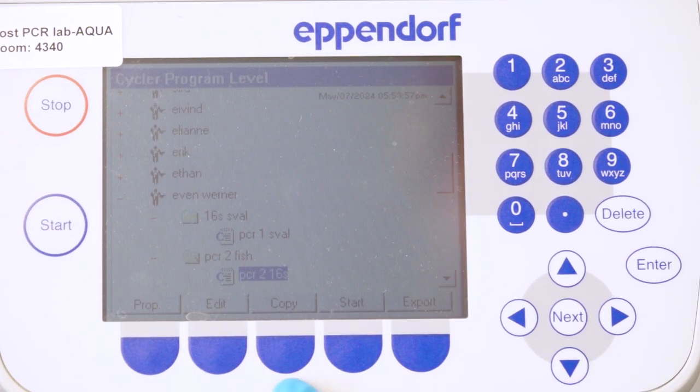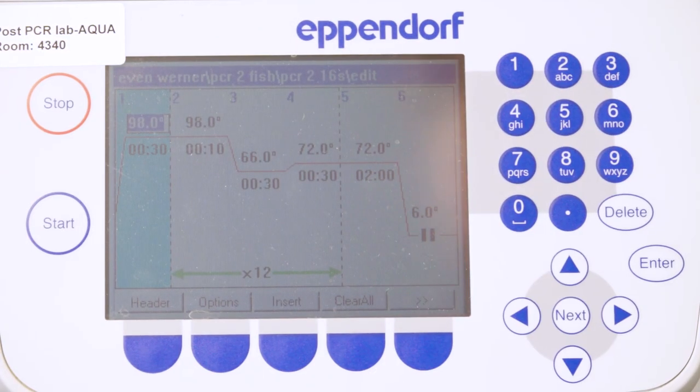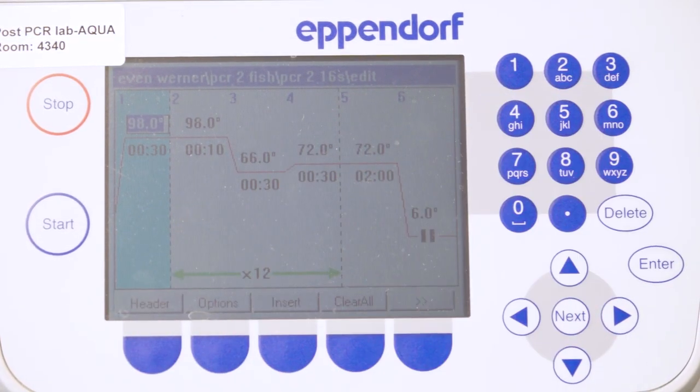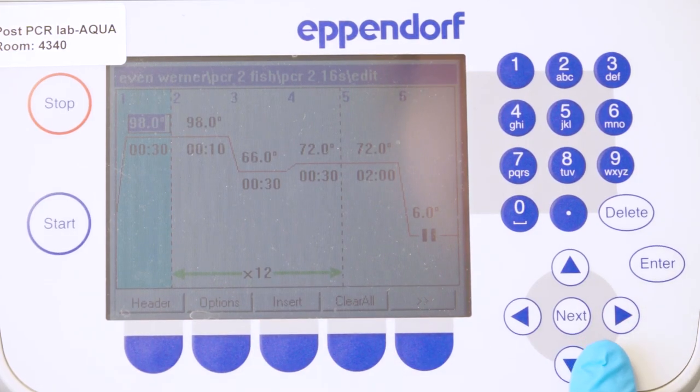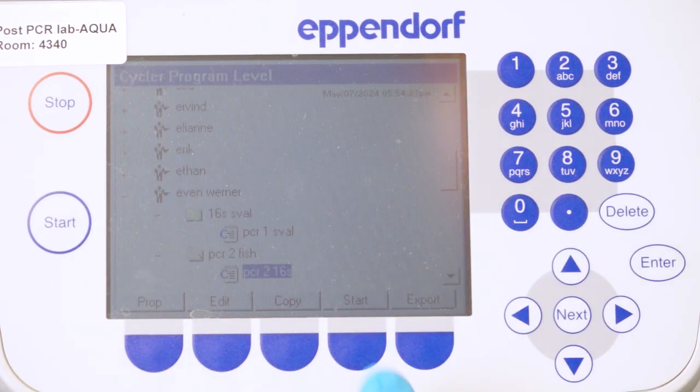Then I can go to edit. The reason why I go to edit is just to double-check if all the settings are correct. Here I compare with the protocol I'm using for the given primers. This one I know is correct—we have 12 cycles. Then I just exit, open the cap here.